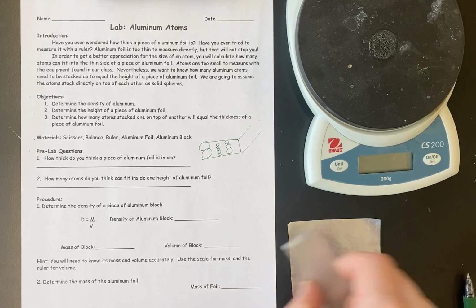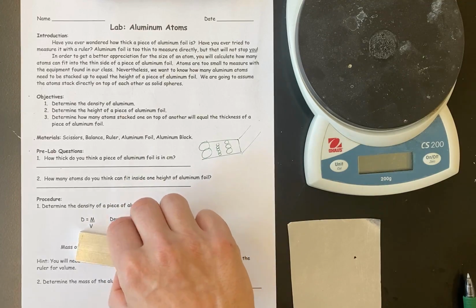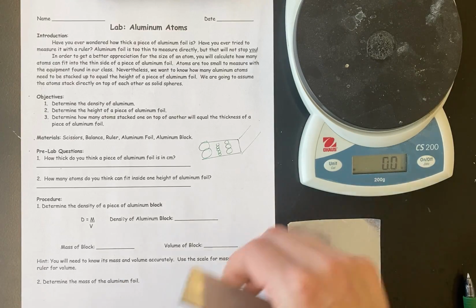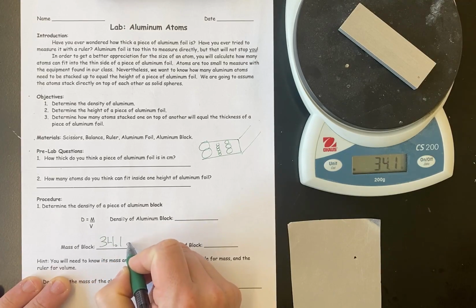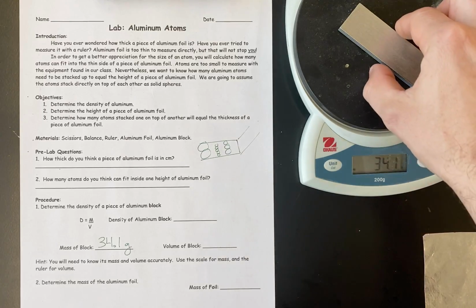Your first step is to use this block and determine its density. So this is an aluminum block, we're going to determine the density. So the first thing we do is we weigh the block. So this block weighs 34.1 grams.